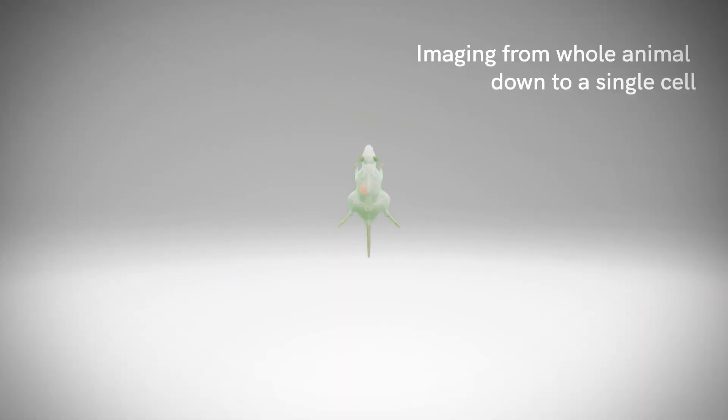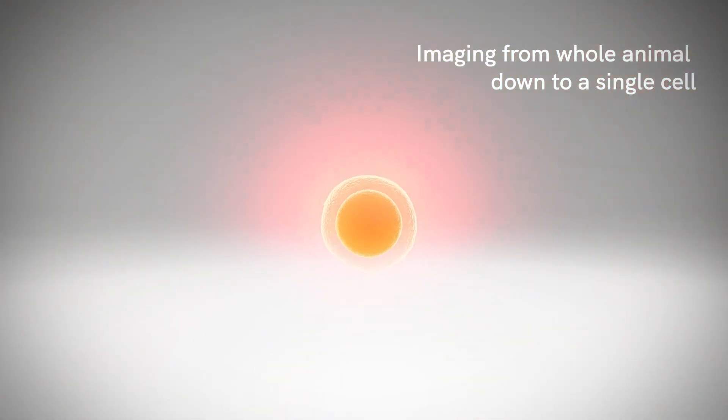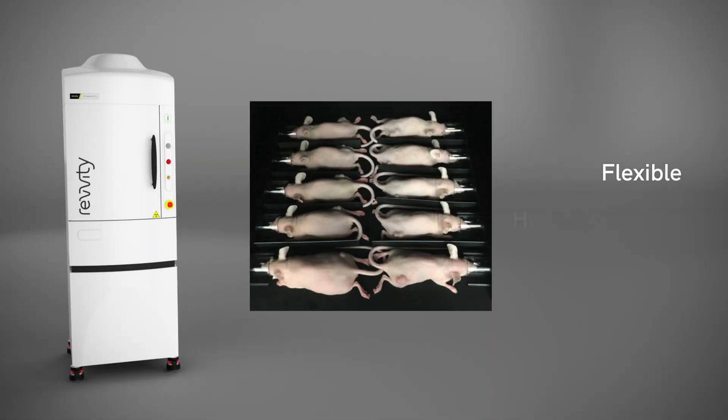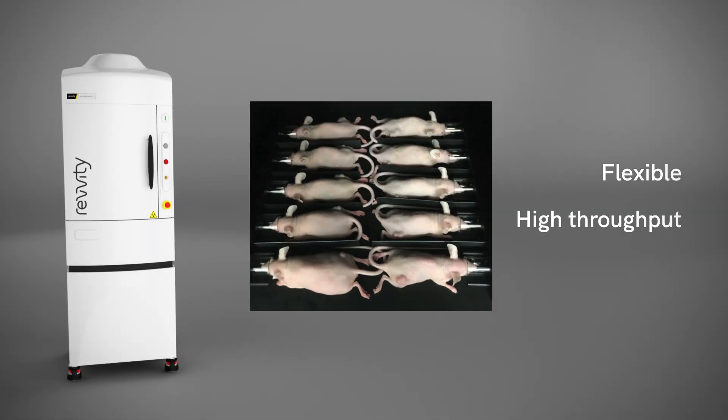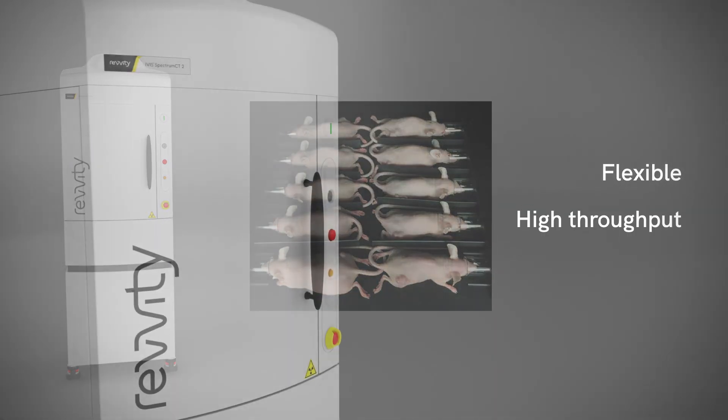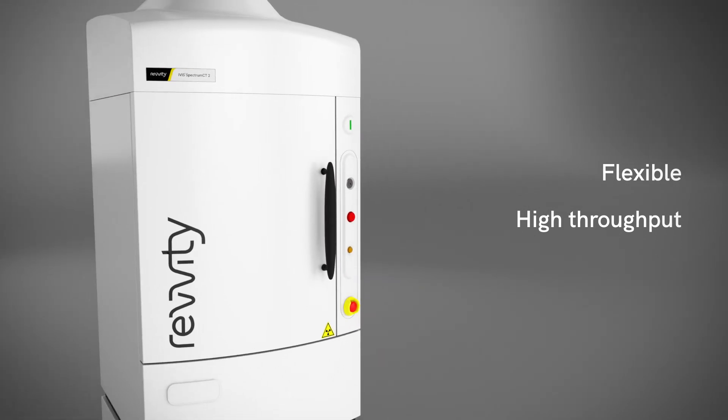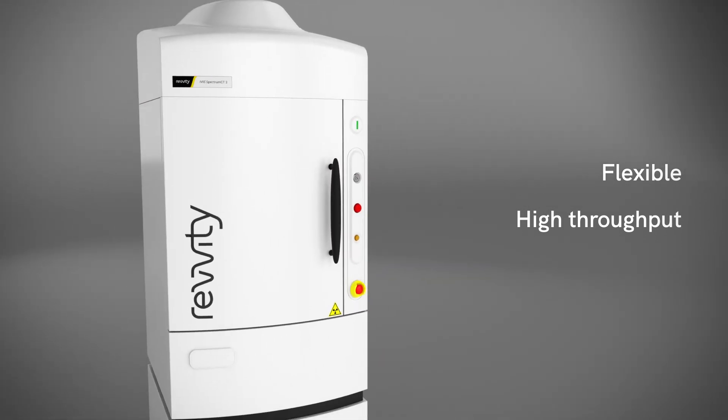From whole animal imaging down to a single cell, the IVIS Spectrum 2 platform gives you the flexibility, throughput, and quantitation you need to take your research to an entirely new level of sophistication.